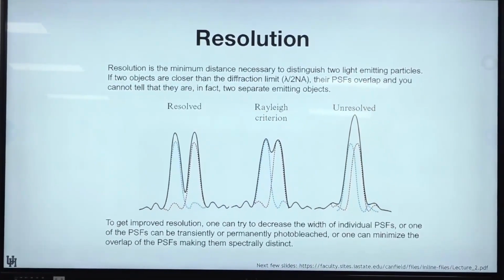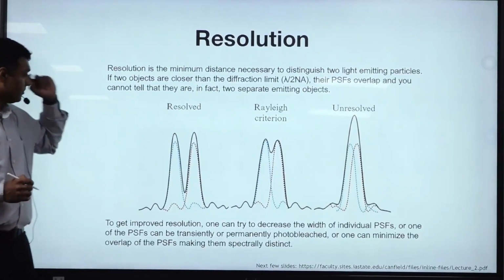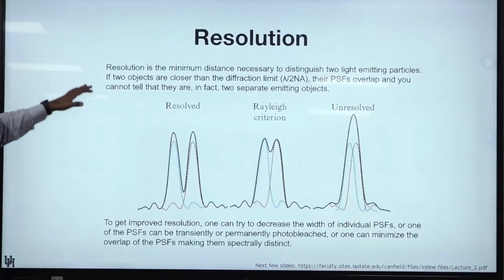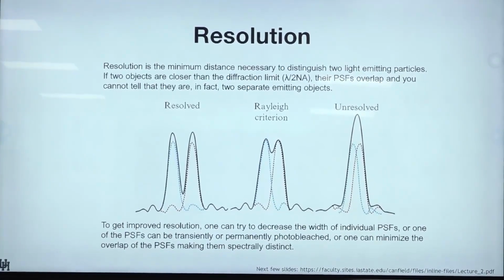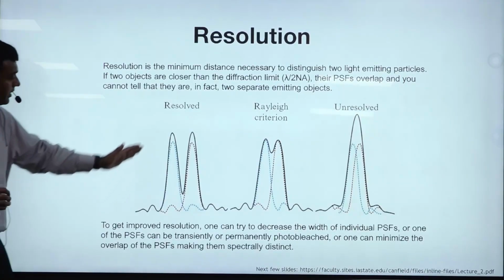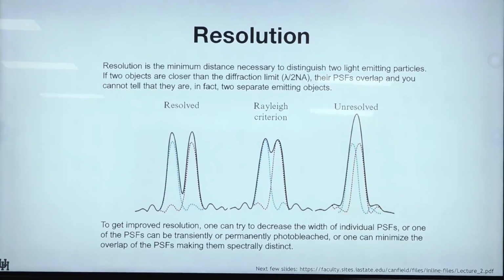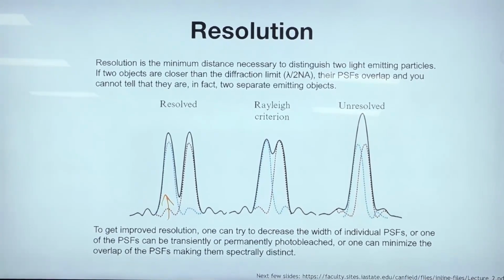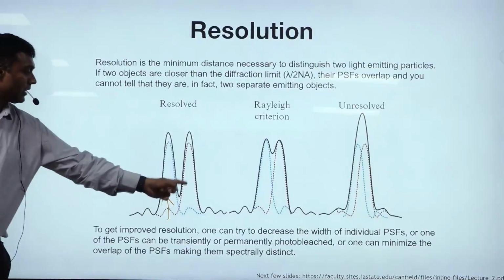Okay, so getting back to the basics. If you think of the definition of resolution, which is related to the diffraction limit, say you have one point spread function, which is your one blur, one diffraction limited spot. If you take a cross section in one dimension, it looks like this curve.